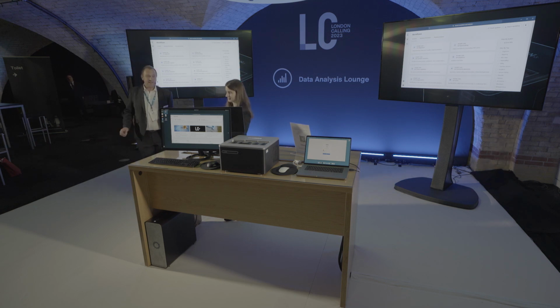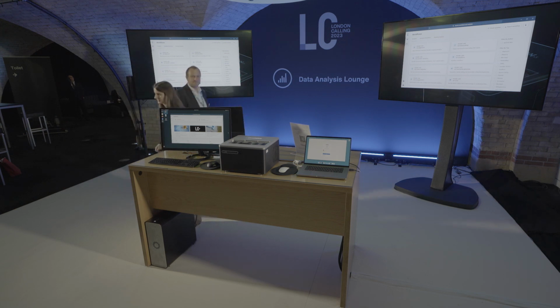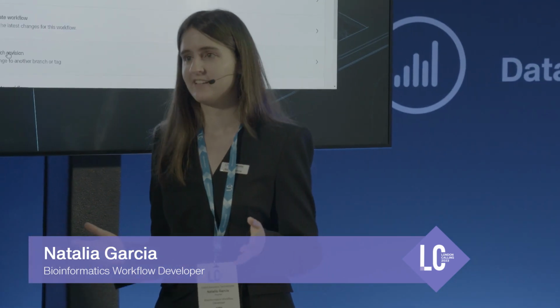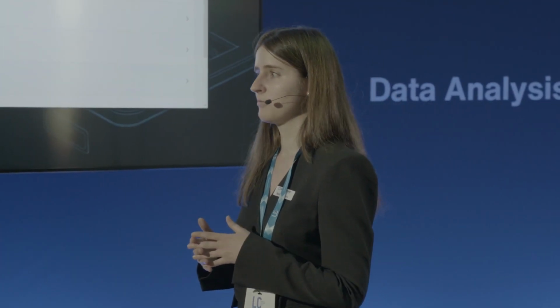So Natalia here is going to speak next, and she's going to talk a little bit about our metagenomics workflow. So Natalia, please. So hi, everybody. I'm going to show the metagenomics workflow, which is our pipeline to analyze metagenomic data. So as you probably know, analyzing metagenomic data is a challenge because there are too many possibilities. So that's why we focused on elucidating the taxonomic composition of the samples.